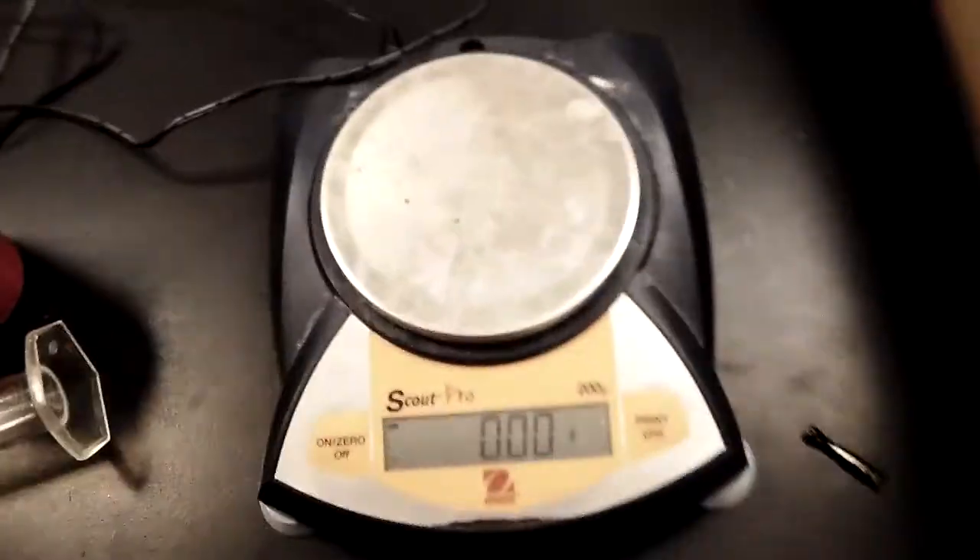This is a crash course in chemistry gear — specifically the equipment section. We're going to cover two things today: how to use the electronic balance, which is the key thing, and it's pretty simple. I'll flip the camera to the balance so you can see.